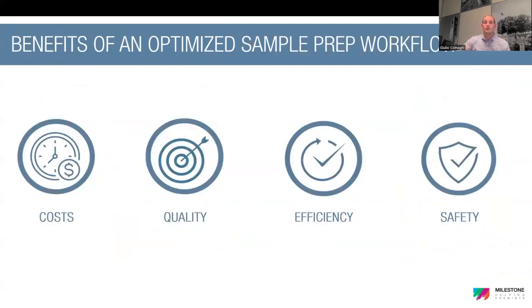So the total sample preparation workflow approach aims to optimize the cost of the analysis, and this can be done by using an in-house subboiling purification system, for example, or to increase the quality of our analysis through a better digestion or a better extraction process, or to enhance the efficiency through the use of disposable glass vials that completely eliminate the cleaning step, and even to increase the safety, for example, with the use of an automated reagent dosing system that does the work of the operator without exposing the operator to hazardous chemicals.